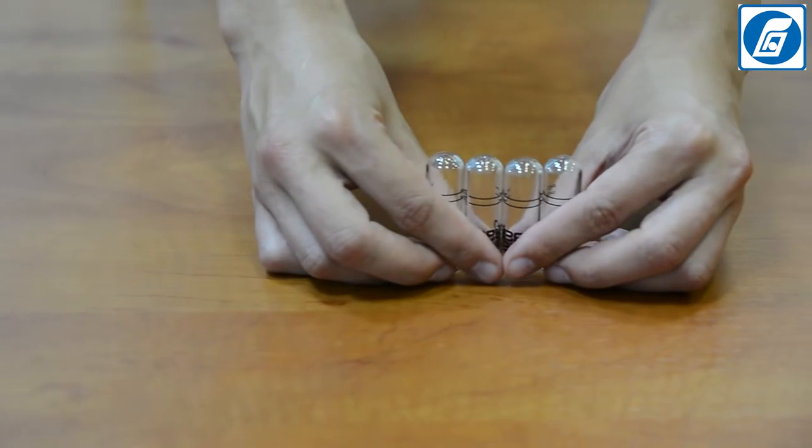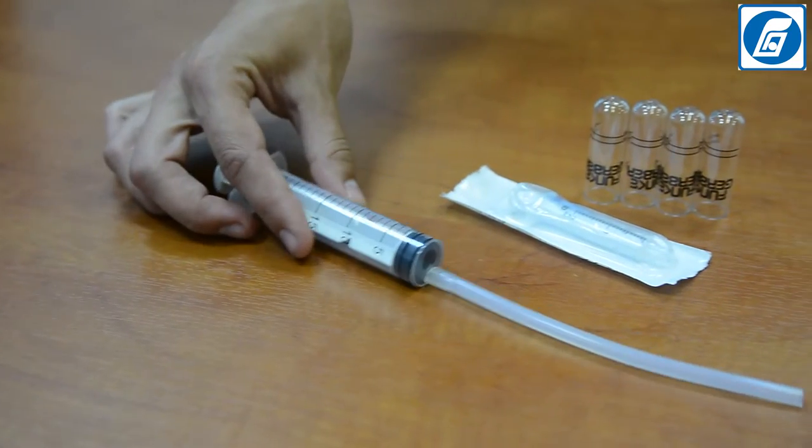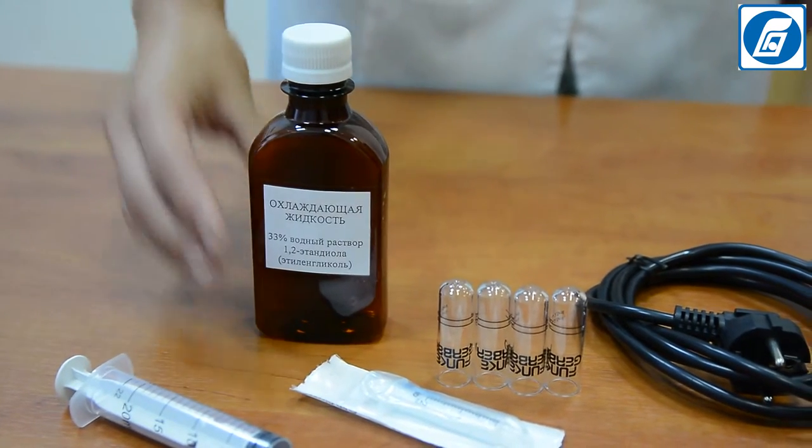The complete set of the analyzer includes: 4 test tubes, a 2 ml syringe, a 20 ml syringe with a silicone tube, a power cable, a container with cooling liquid, and an operation manual in English.